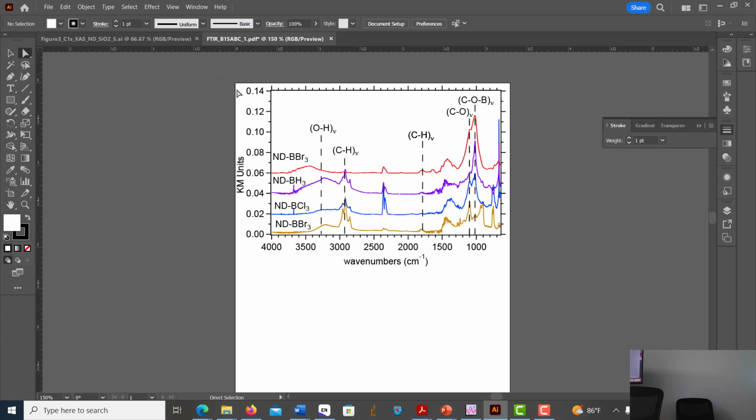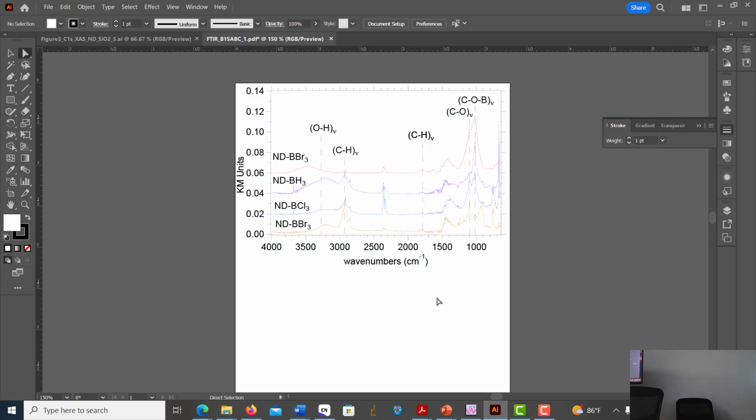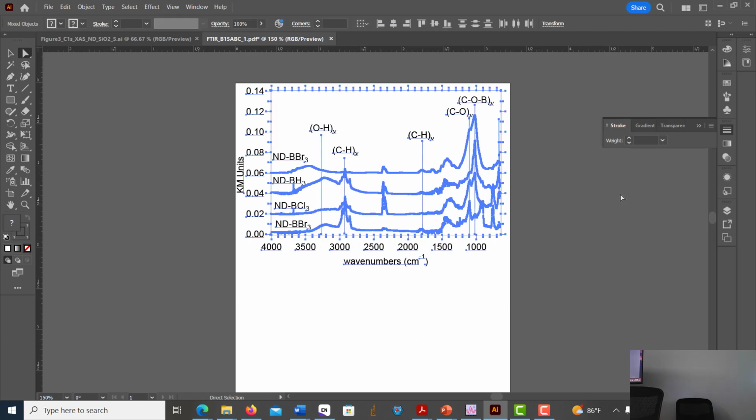Okay, that looks decent. If we did 0.1, even thinner, what do you think about that? Yeah, too hard to see. So you're finding that sweet spot between the line thickness and your ability to see all of your data properly. So let's stick with 0.5, and we hit enter.